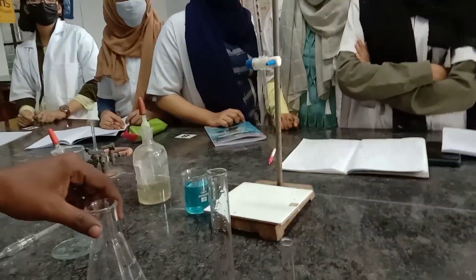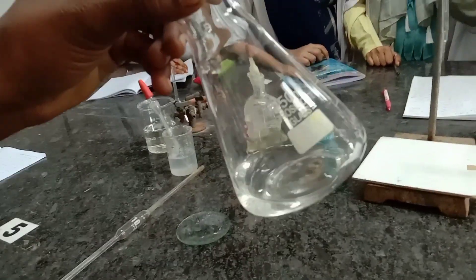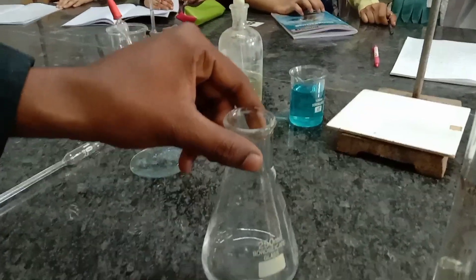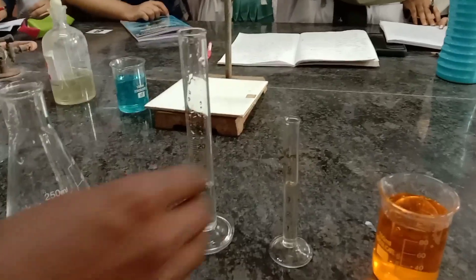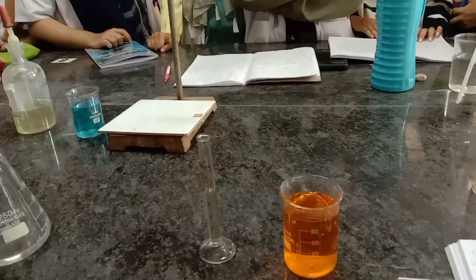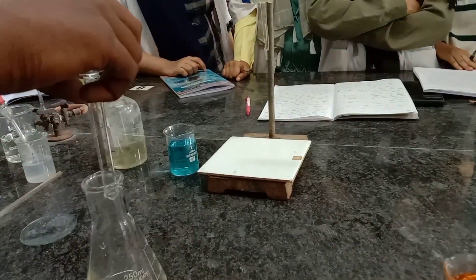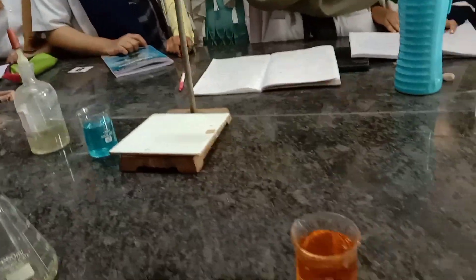For this, we need to take a conical flask. Into this, we drop 25 ml of distilled water measured with a measuring cylinder. To that, we add 10 ml of potassium iodide. Next, 4 ml of concentrated HCl. Then we add 10 ml of standard potassium dichromate solution.